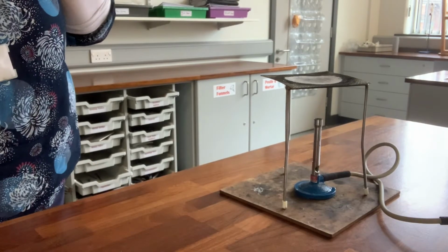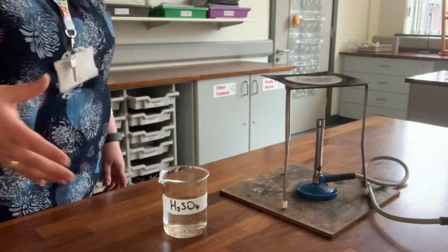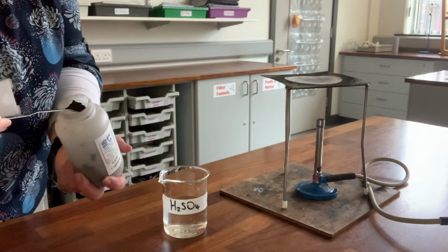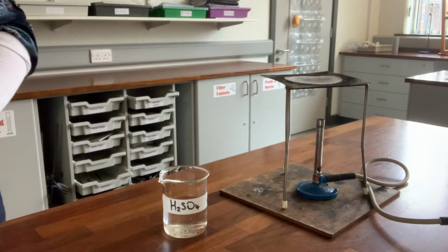Hi, so in this video I am going to talk about what happens when we react a metal oxide with an acid. So we're going to use sulfuric acid, which is a colourless liquid, and copper oxide, which you may or may not know is a black powder. And we're going to look to see what happens when we react these two together.